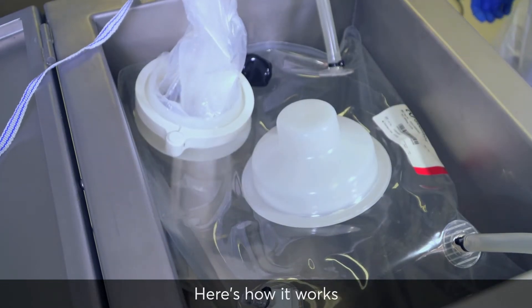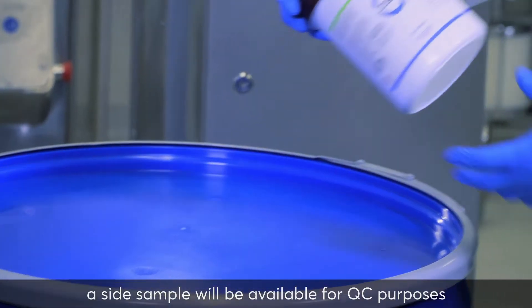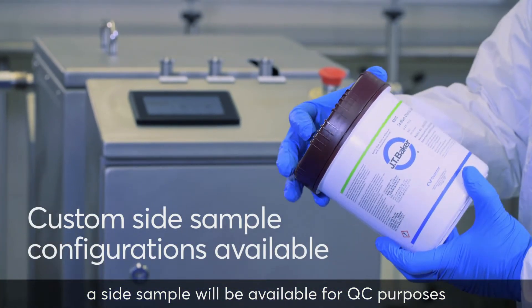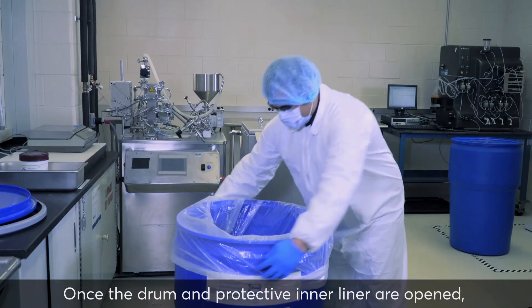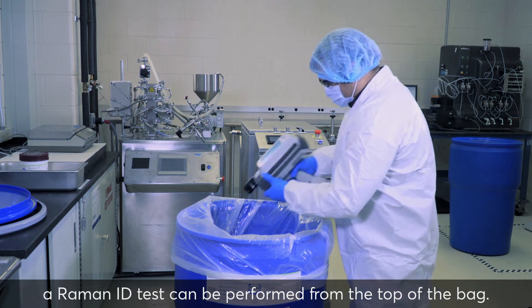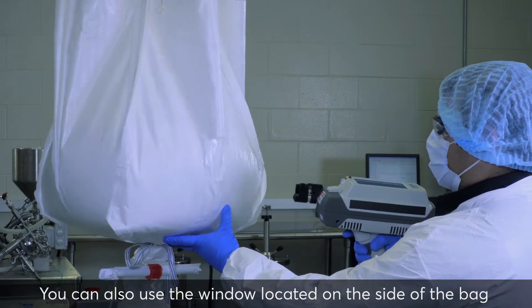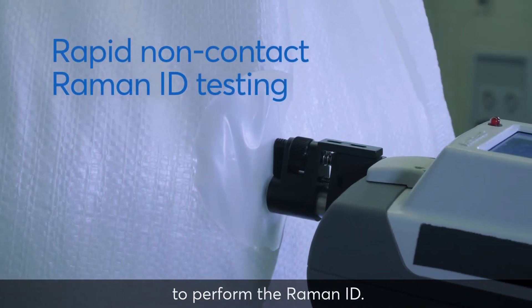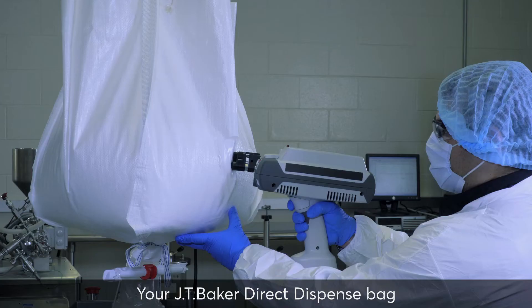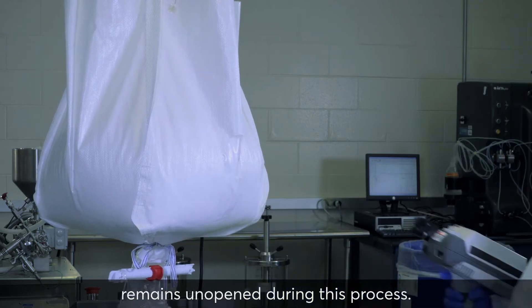Here's how it works. Upon receiving your specified materials, a side sample will be available for quality control purposes. Once the drum and protective inner liner are opened, a Raman ID test can be performed from the top of the bag. You can also use the window located on the side of the bag to perform the Raman ID. Your JT Baker Direct Dispense Bag remains unopened during this process.